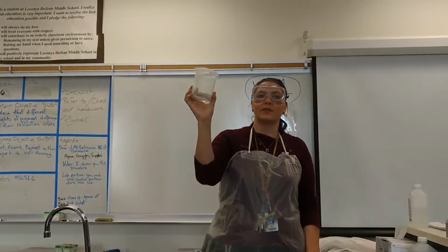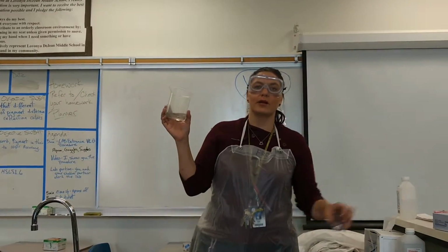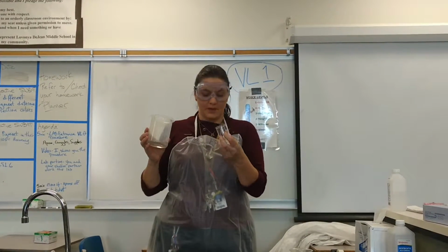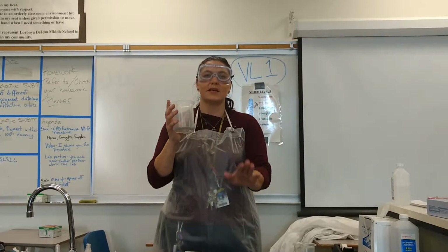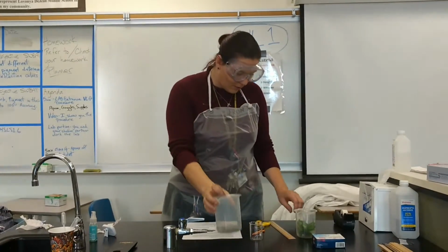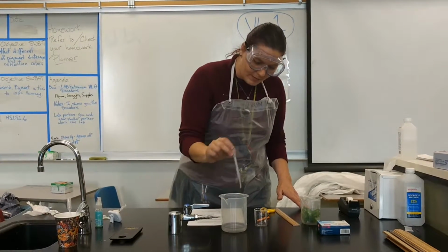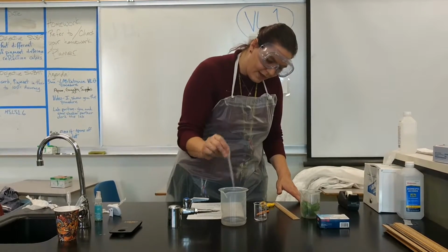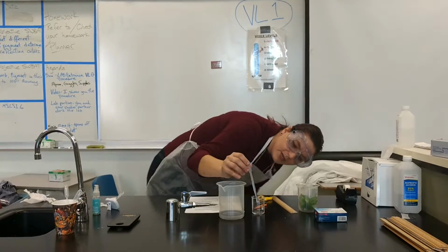Please be very careful with this container. Now this container is not the one we're going to use. We are actually going to use this container, your 50 milliliter container. However, whenever we have a solution, we always keep the base separate from what we're using. So what I will do is, using my eyedropper, measure up enough to get all the way up to 10 milliliters. And I'm going to go down.